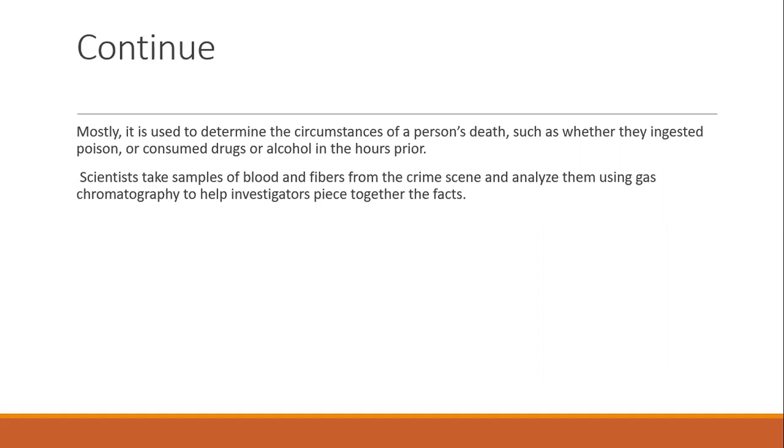In the same way, for measuring air pollution, gas chromatography is being used to combat the problem by monitoring the levels of harmful pollutants in the air so that scientists can visualize where air pollution is more concentrated and how this changes throughout the day and the year to develop effective preventative methods.